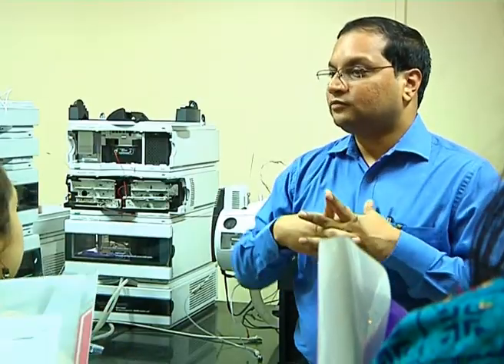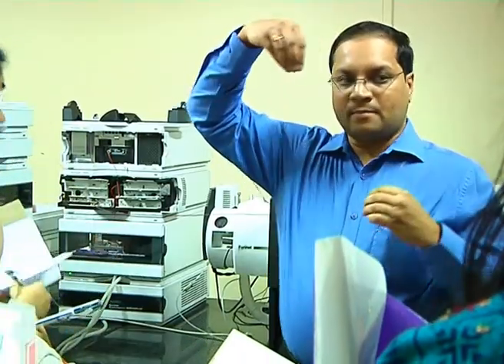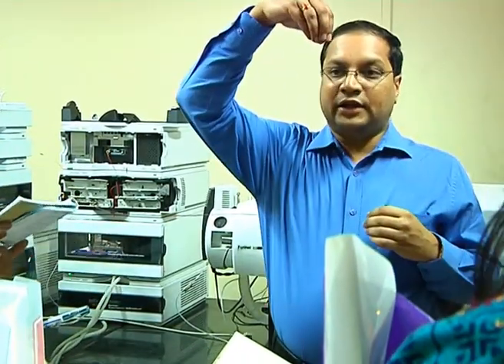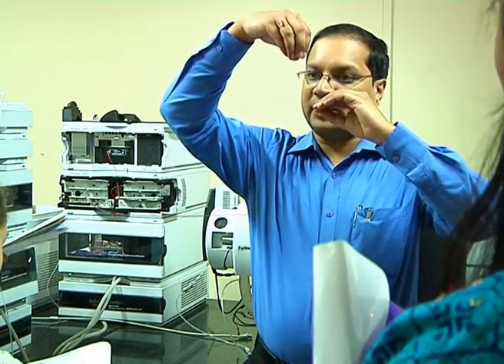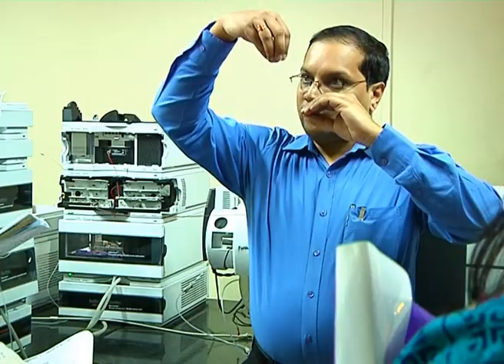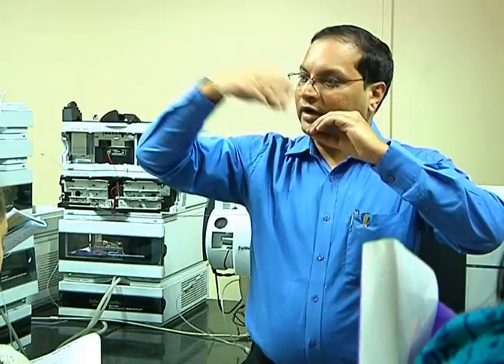Electrospray ionization, or properly called pneumatically assisted electrospray. Why so? It is something called a spray. The stream of liquid is going into the needle, and then it is sprayed. Why so? Because our analytes, we already know, are charged. So the charged particles or charged analytes are already there in the liquid. I want only those to get in, not the acetonitrile, formic acid and all those things. I want to get rid of that and only ions should go in. That is the objective.